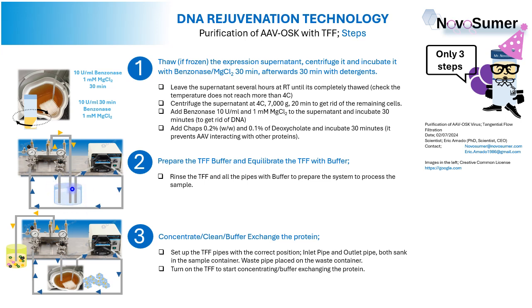So that will go this way in a closed circuit, and also on this occasion the other circuit, the open circuit, will be closed because, as you can see here, the buffer will run through the waste pipe to here again, so everything will be closed.